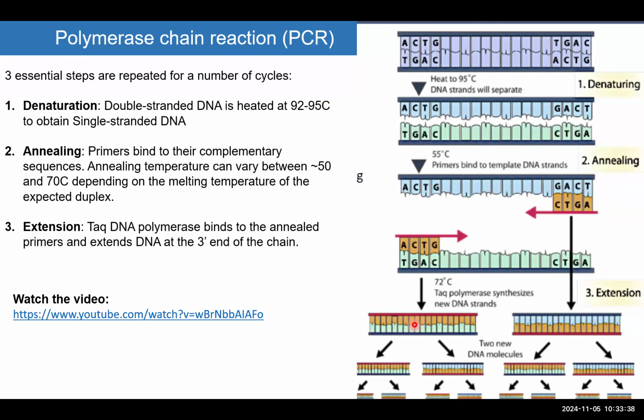So for today, we will describe the difference between a PCR and a qPCR or quantitative PCR. So you remember when we perform a PCR, we need to set up a reaction which contains a DNA template, which is the DNA we want to amplify. And we need an enzyme to read it, which is the polymerase, the Taq polymerase. We need primers to start the polymerization step, always starting from 5' to 3' end.